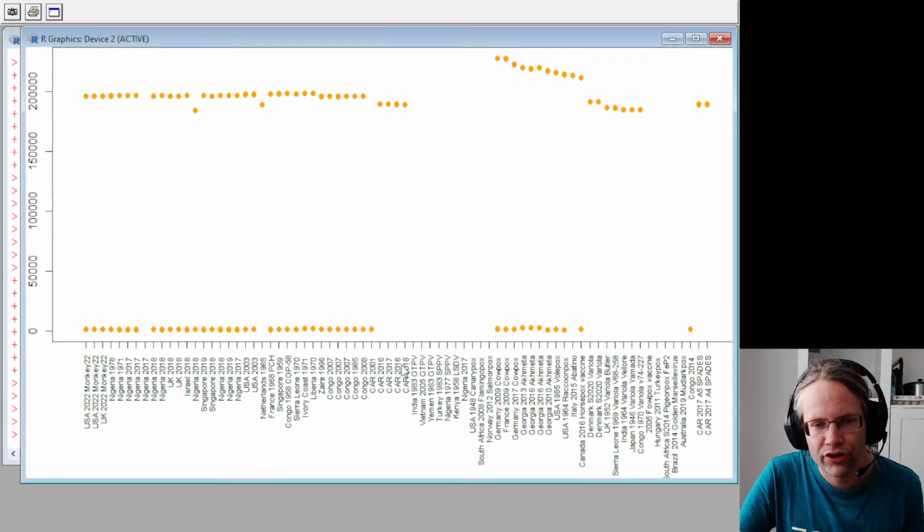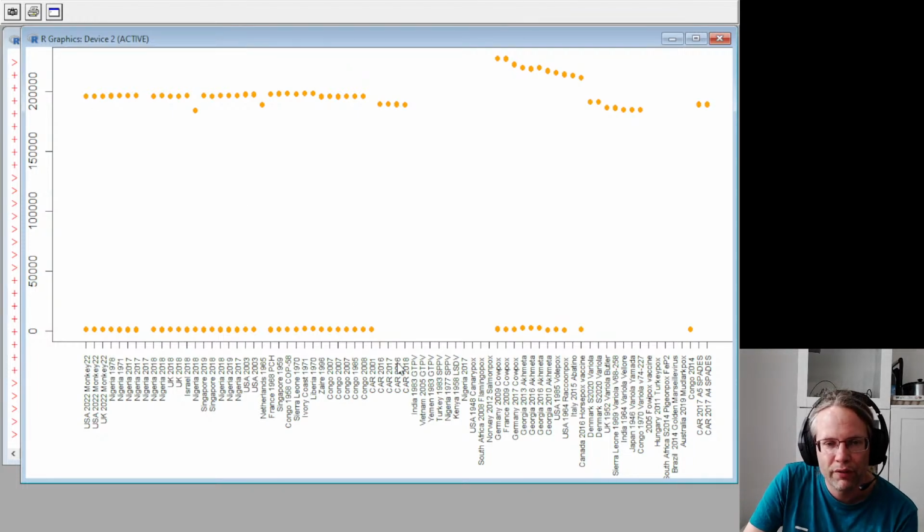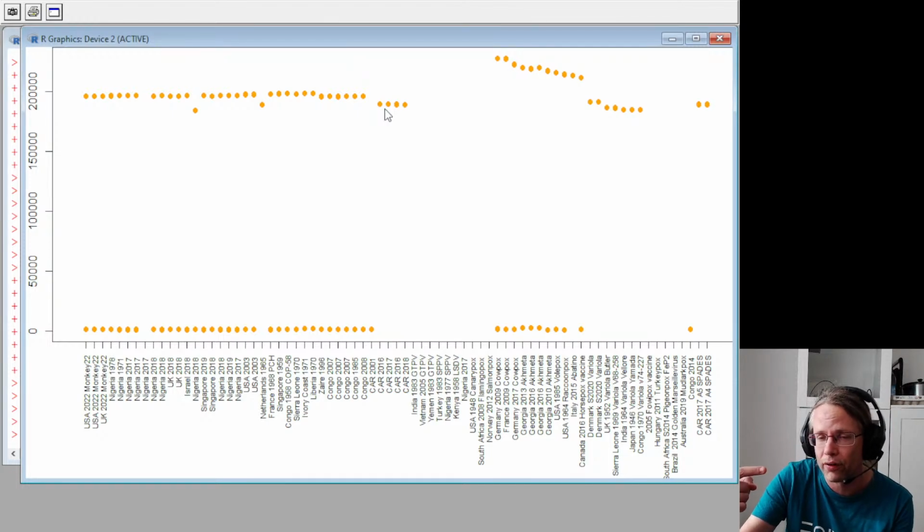So what we can actually see is that this gene is normally 2 times in the genome of monkeypox, right? In the new monkeypox, it's at the beginning and it's at the end of the genome. However, when we, for example, look at the Central African region, so the other clade, because in Africa you have 2 different strains of monkeypox. You have the West African strain and you have the Central African strain. But the Central African strains don't really seem to have 2 copies of this gene. They only seem to have 1 copy of the gene at the end of the chromosomes.